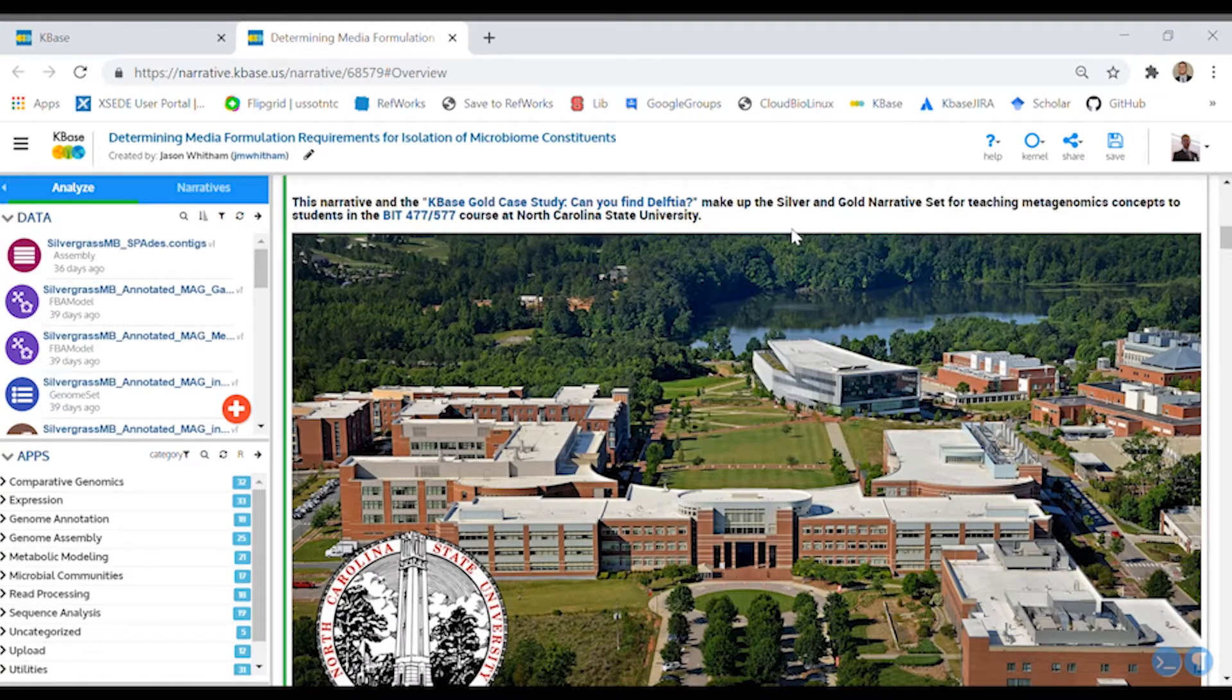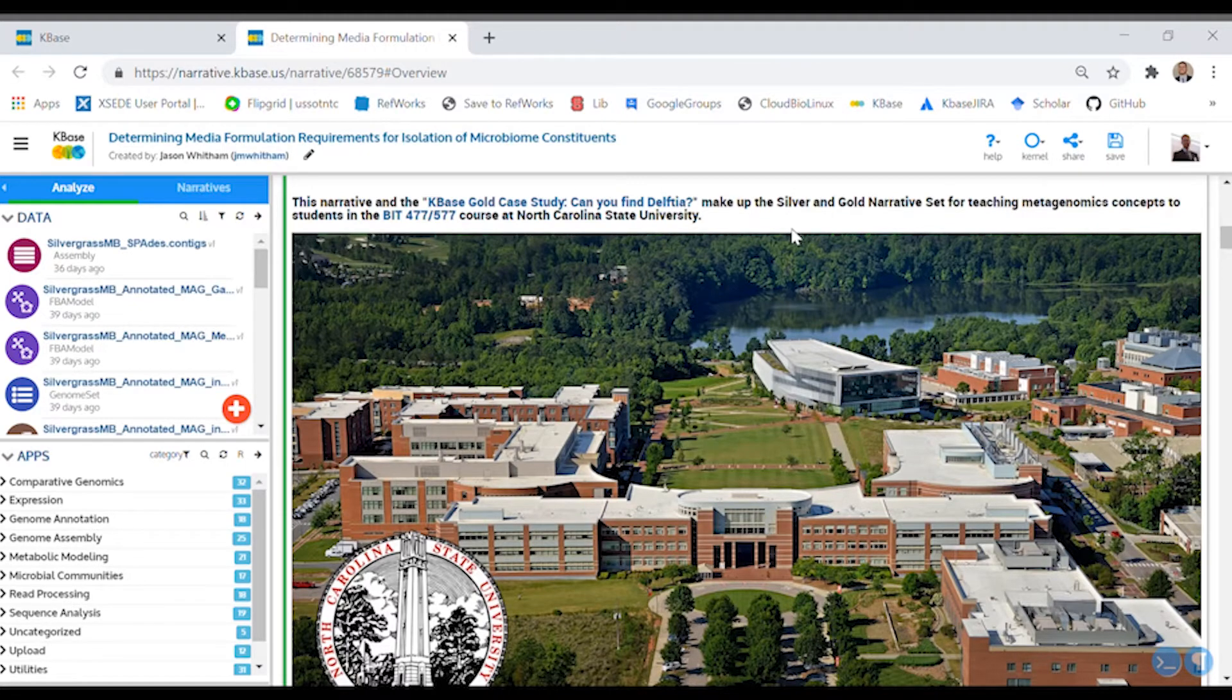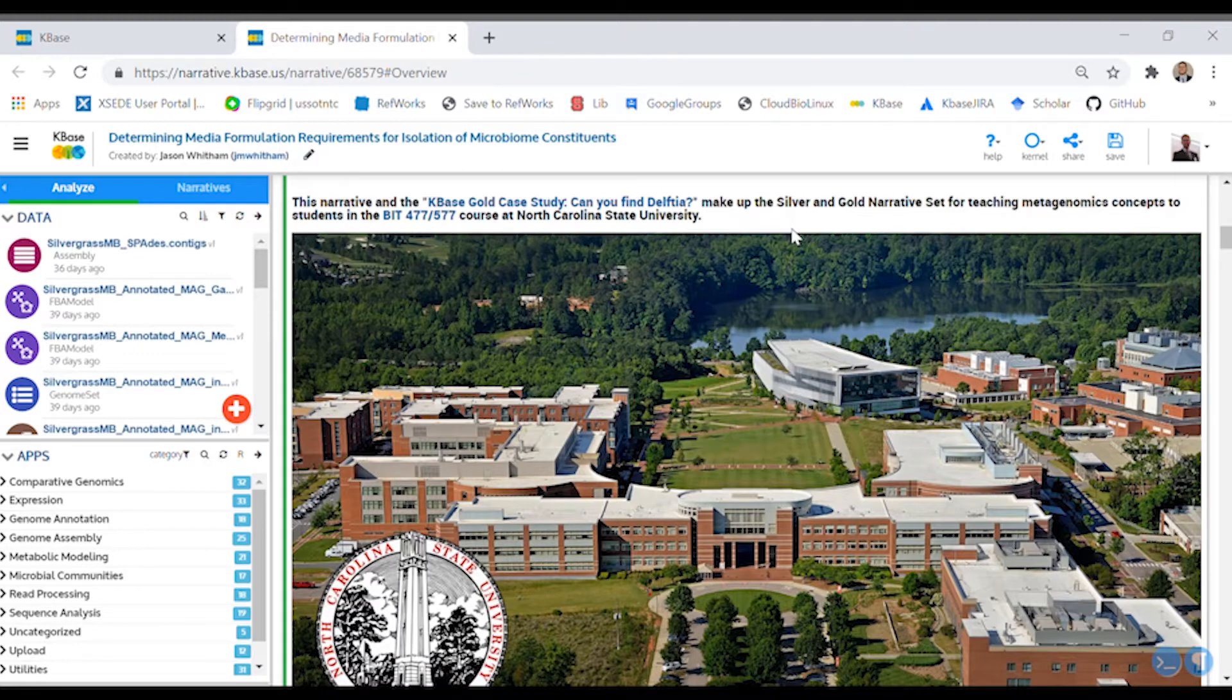The KBase narrative is called Determining Media Formulation Requirements for Isolation of Microbiome Constituents. It's a publicly available narrative and can be found with search on the KBase dashboard.